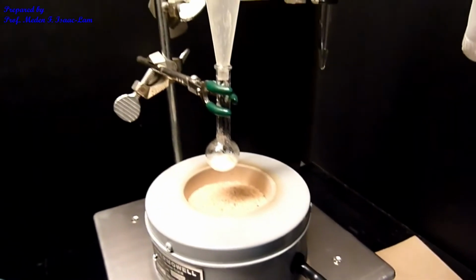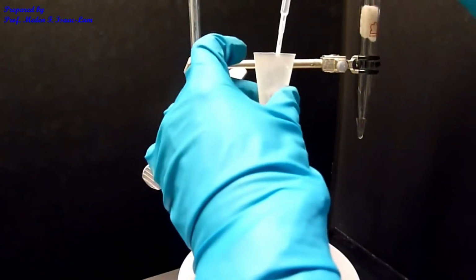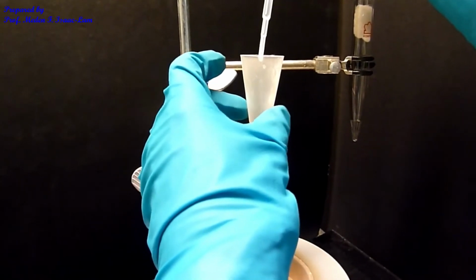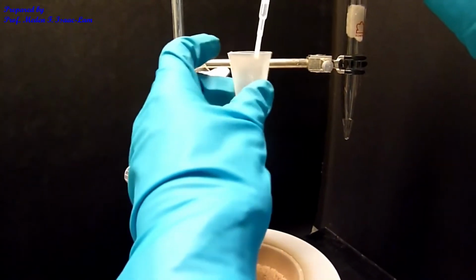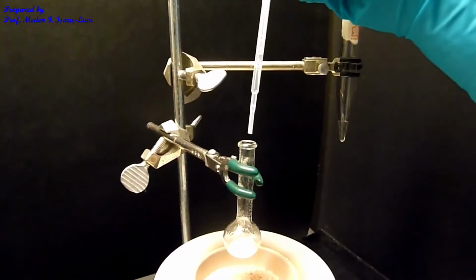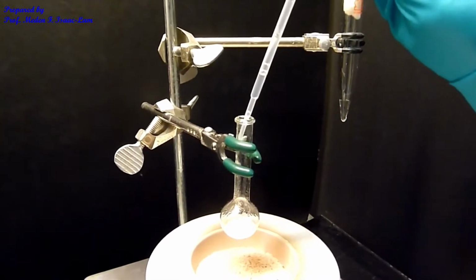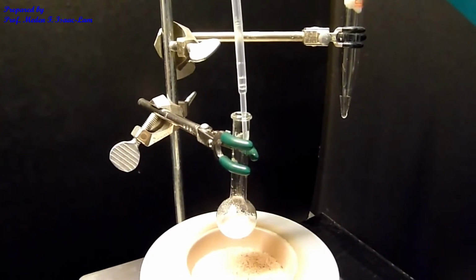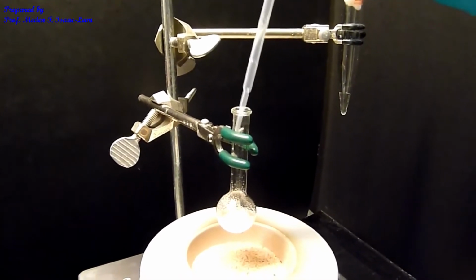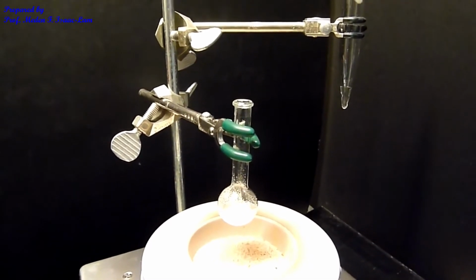So I want to rinse the funnel so that everything is in. And then I also rinse the side here. So that is now our setup.